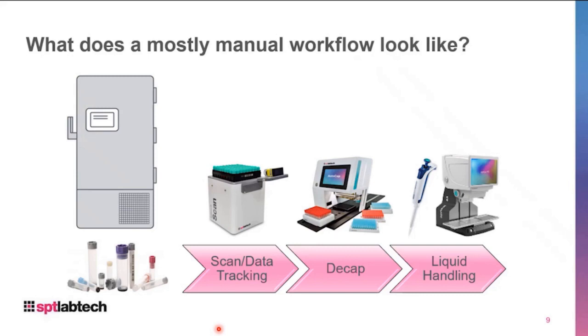But capper decappers, again, this is screw cap related, usually have to take the caps off, whether by hand or an automated solution. And again, everything in laboratory focus most of the time ends up being in the liquid handling aspects. So whether hand pipetting or using bits of automation, we have to do something upstream of the sample to get to that automation step so that we can provide those assay ready plates or test for diagnostic samples. Again, small bits of automation can help streamline that process from the beginning.